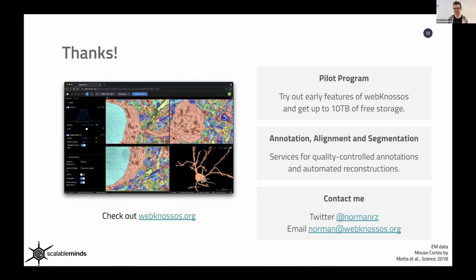Thanks. Thank you very much, Norman. It's really a wonderful tool. So we have some data hosted there, and it's really nice to explore it. If I understand correctly, people can also generate ground truth if they want to do automatic segmentation. Because I know a few people that try to make their own tools, and that could also be very, very useful. I don't see any questions in the Q&A box.